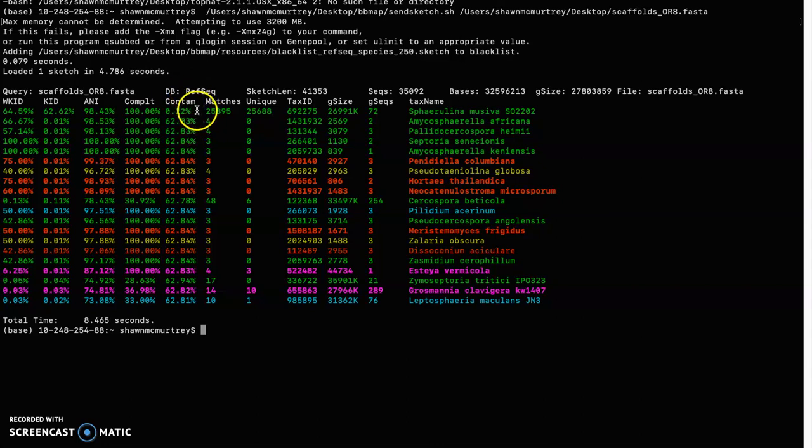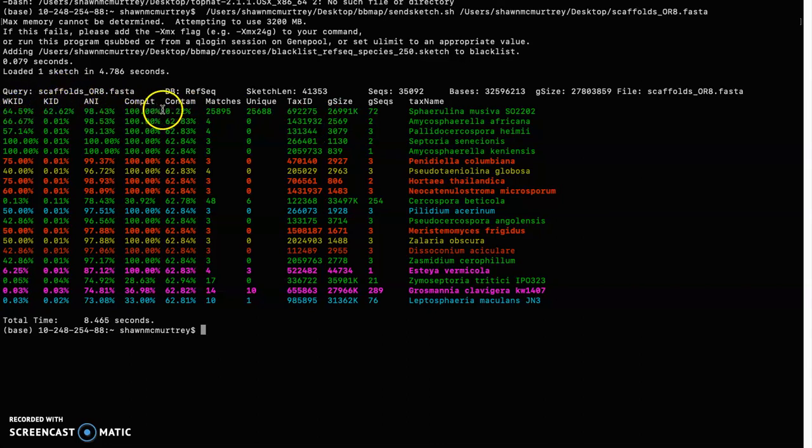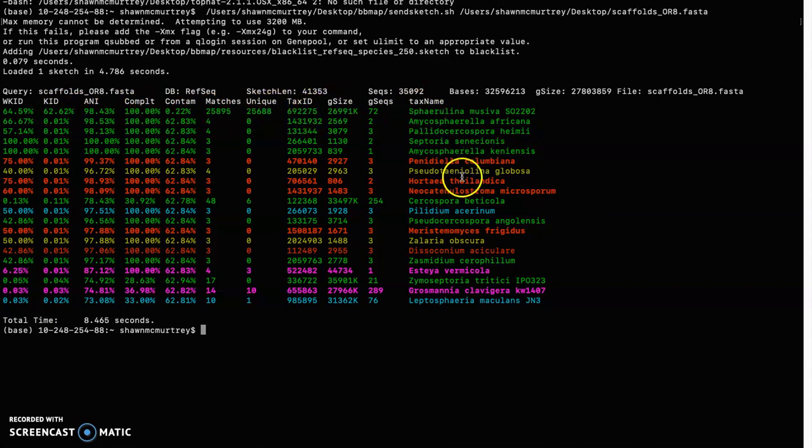It also gives you other statistics. I'd have to look in the manual and see, but I think these are k-mers and other things, and the tax ID of what it thinks those contaminants match with.